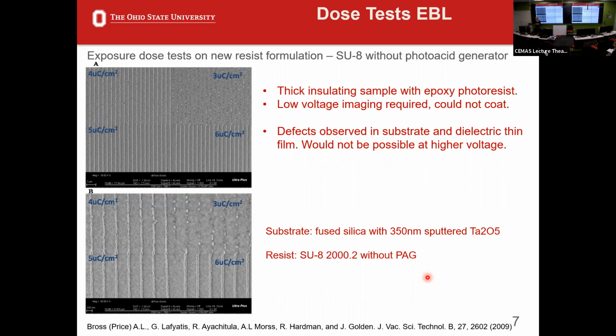I was going to ask, I've worked with people a little bit on semiconductor stuff, and sometimes I've seen people go slightly higher kV to go through a layer to reduce the charging. Is that something you try often, like increasing kV? We don't, but that doesn't mean we shouldn't. We have in the past done ECI on our tool. We only use higher voltages to do ECI and EDS. Now, neither of those exist on our tool anymore.